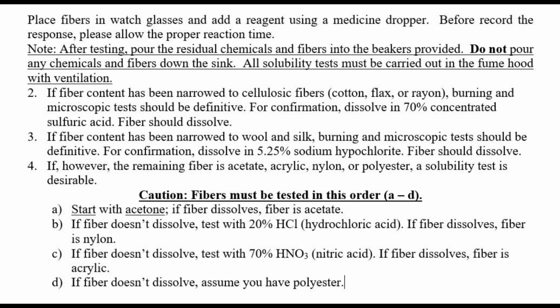If it dissolves in hydrochloric acid, then it is nylon fiber. If it dissolves in nitric acid, the fiber is acrylic. If the fiber doesn't dissolve in any of these chemicals, then it is polyester.